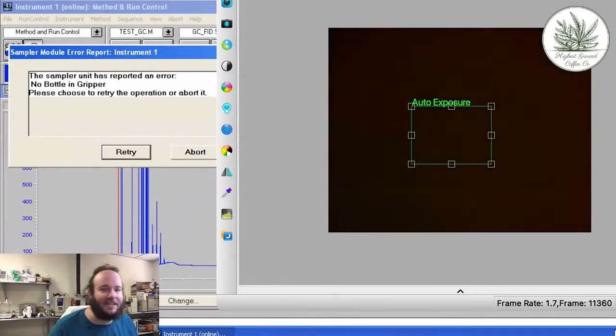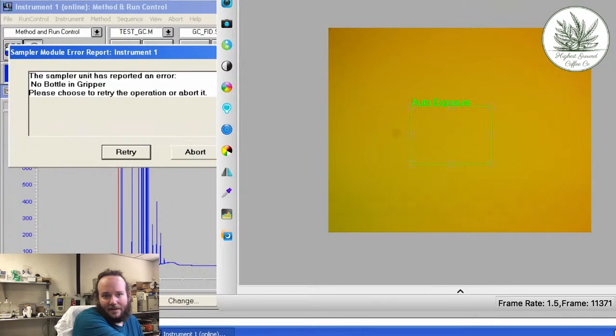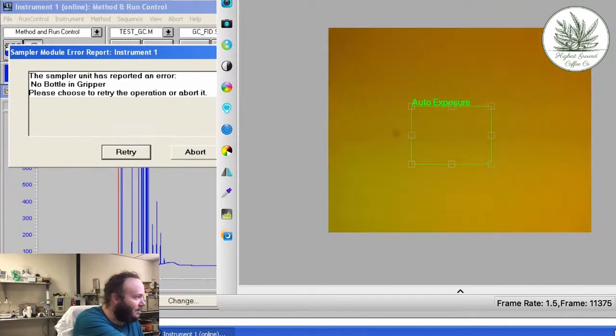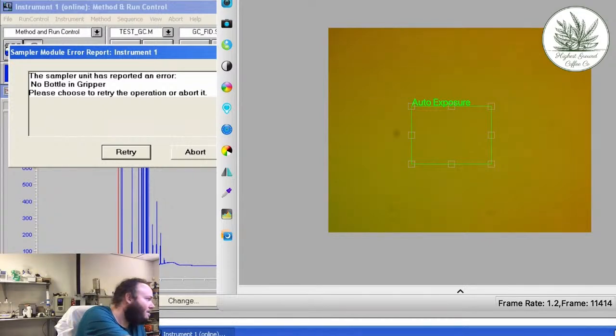All right, so this is a 60x objective. I just got to try to find some focus here. No, I'll pull in that way. See if we see anything. So I think that, oh, wait, hold on. I was almost about to give up. I see something.